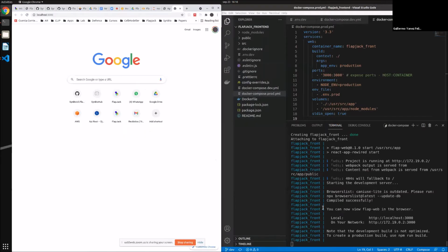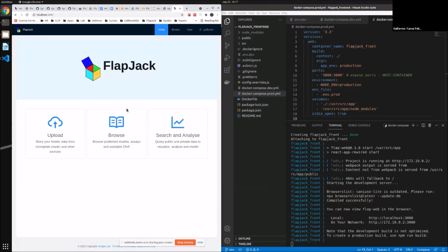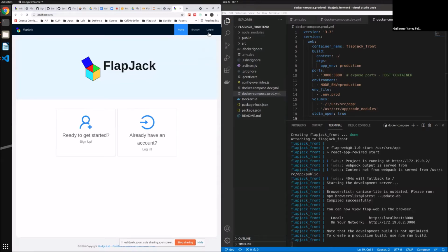Now it's done. Also pay attention to this: this is a development server and a development environment. So now we check, and it's working. And this is an error. No, that shouldn't happen, because it cached my session in the public instance. So it's working for me, at least.